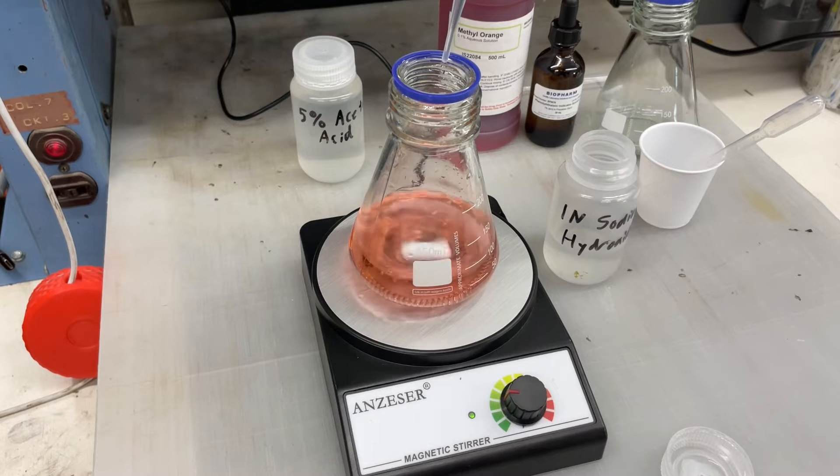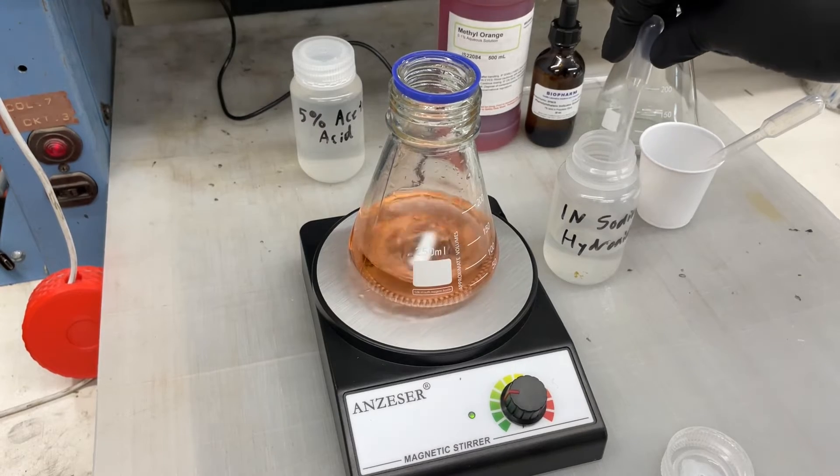You're going to see the color change — it's kind of subtle, which is why I add extra — but it changed from a pink to an orange right there. And that was 11 mils.